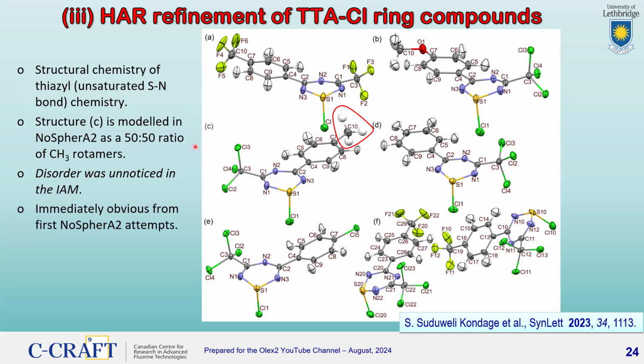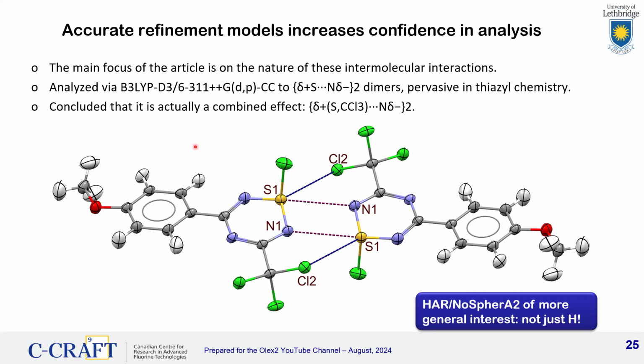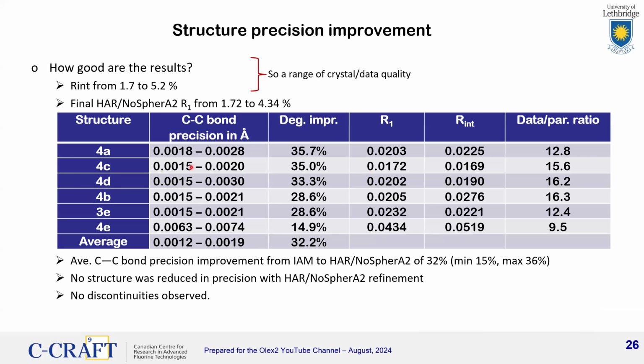So this is just showing you that we are getting a more accurate view of the electron densities, and hence we are more accurately able to model the structures. In this particular project, we were interested in both halogen bonding and chalcogen bonding interactions. Nevertheless, if you look at the complete crystal lattice, the interactions between these centers were also modified by the dispersion effects involving the hydrogens in the organic component. And so the correct placement of those hydrogens is relevant to these supramolecular effects.